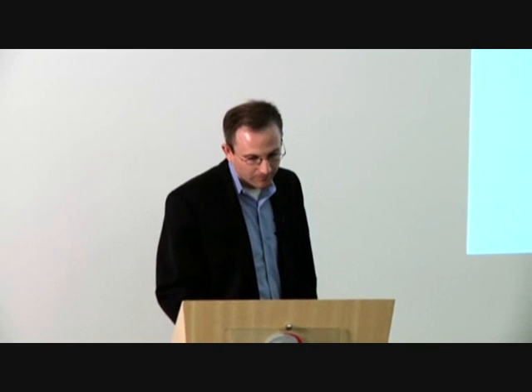We had made engineering improvements to the Sanger technology that allowed us to run machines that Sanger sequenced 24 hours a day, 7 days a week. The Broad Institute and other genome centers had warehouses full of Sanger sequencers that were generating data in an assembly line factory type approach. But the same underlying technology was used in about 2005, 2006, as had been used in 1985, 1986. In the last several years, there's been the introduction of new sequencing technologies that have been very disruptive.